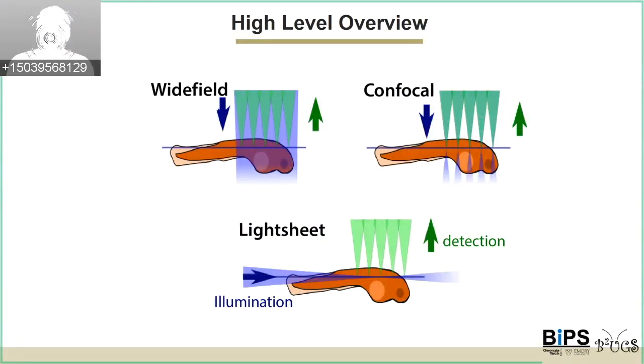Okay, so now we're ready to look at a few different fluorescence microscopy systems. I'm going to cover 3 basic types of fluorescence microscopy that are the basis for many more advanced techniques. These are standard widefield, confocal, and light sheet microscopy. They're built around different types of illumination, which you can see here, and I will discuss more.